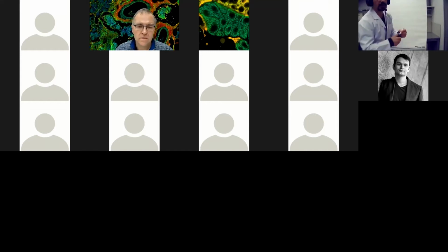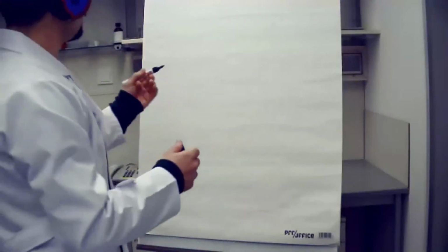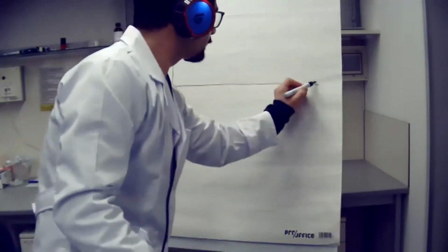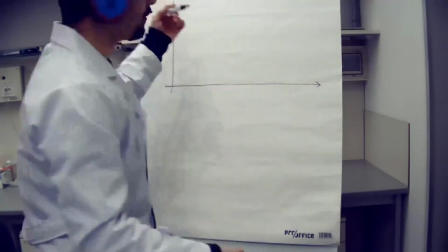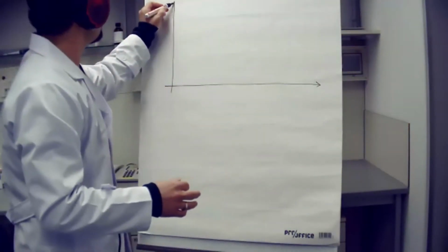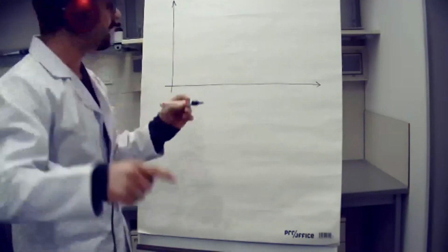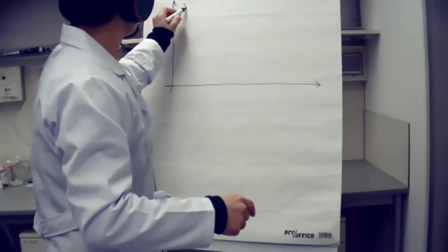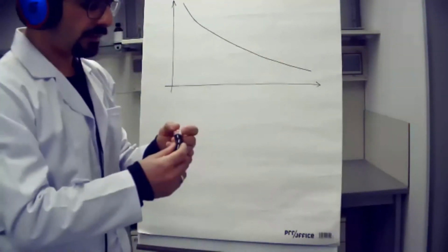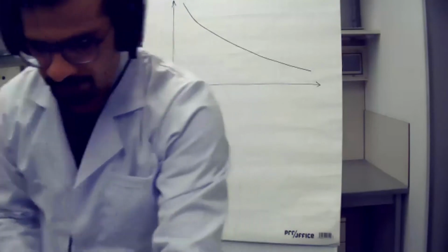Okay, good. So here we have our decay curve. I just ignore the beginning part, which is actually rising up from the IRF. So I just draw that very simply. That's our decay curve. And when we do the analysis for the decay curve, we need to pay attention.